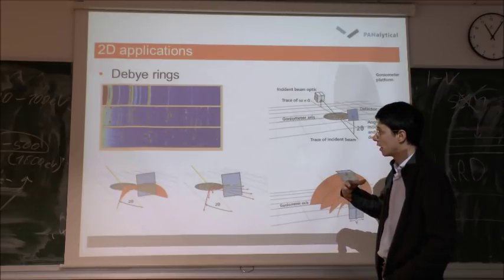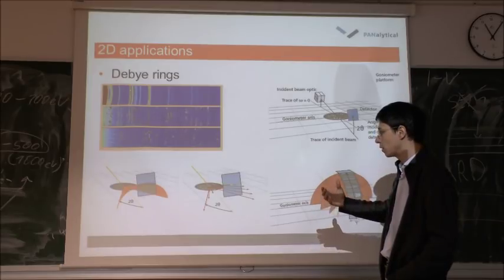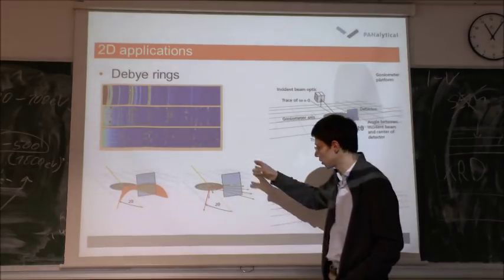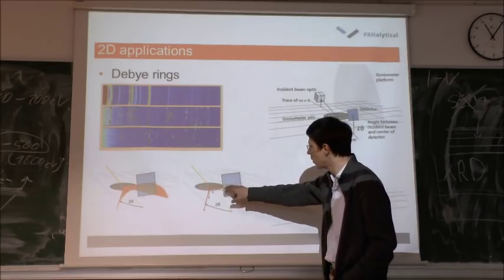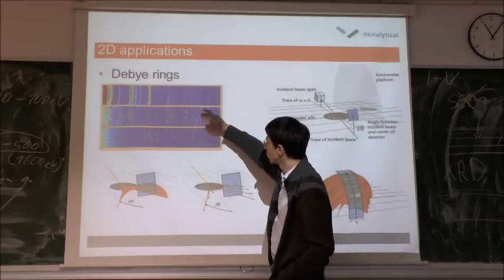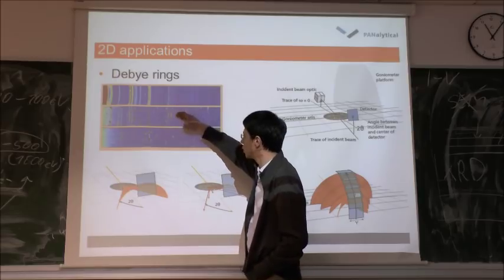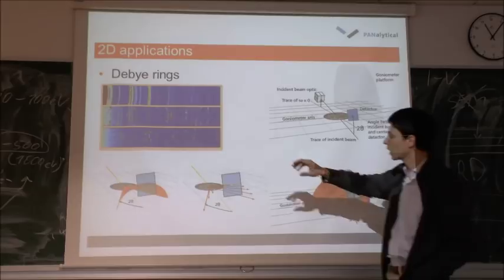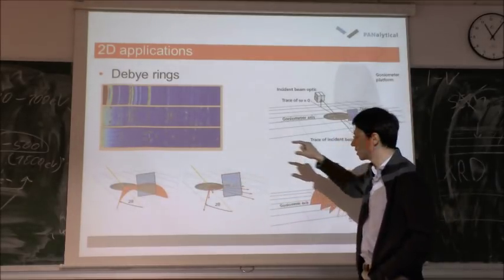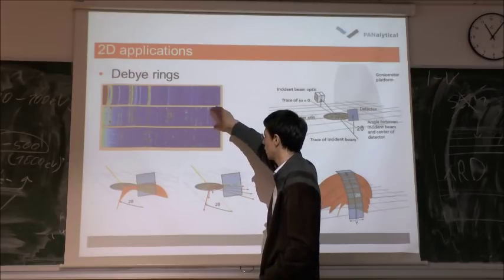Then if you have a material which is, let's say, more coarse, and it's not completely well aligned with respect to the space that is used with your diffractometer, then you have points. Yeah, like here. So actually what you're doing, you're changing this pattern to this one. But basically if you have a single crystalline material, then you would get only certain points. This is also just a more well-oriented polycrystalline material with respect to this one and this one.